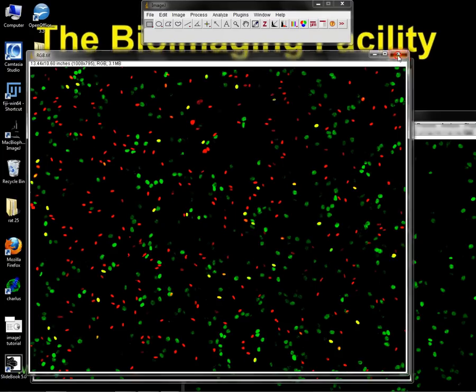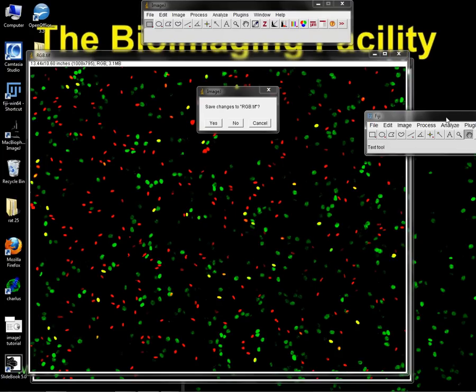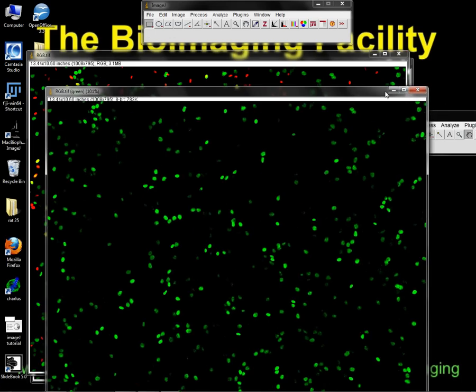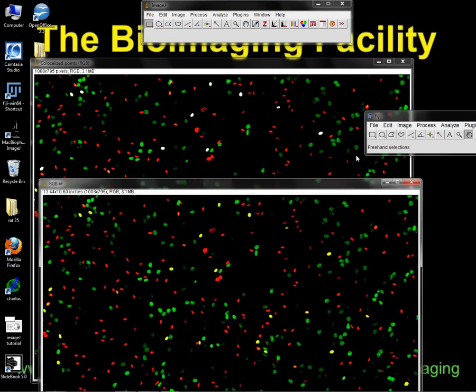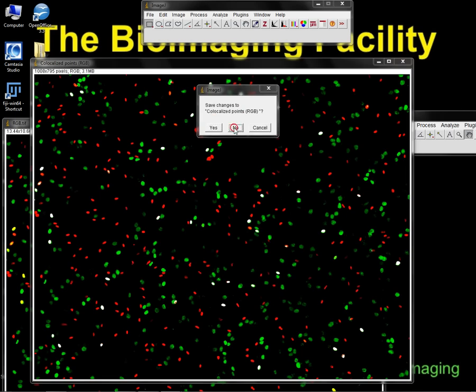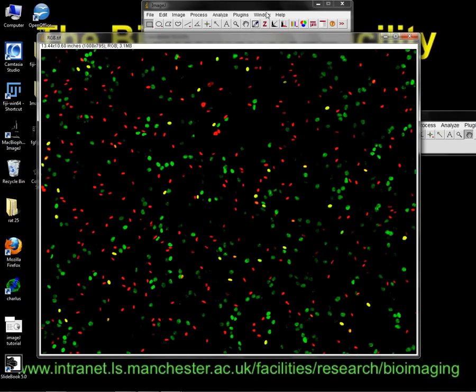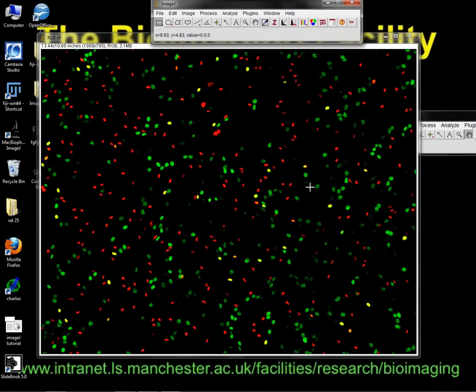Another way is, if you wanted to know how many cells were in my image and how many of my cells had a value above something else. I was thinking about this yesterday, and there's probably a really simple way. I found a really complicated way. But this is the thing, who knows? You've got to just play.